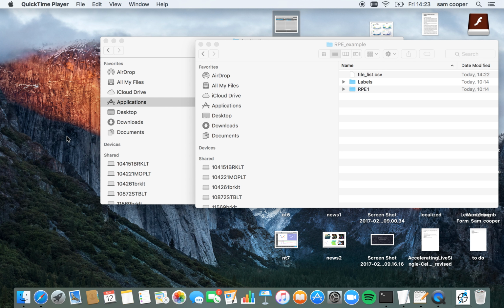Second online tutorial for NucliTrack. In this tutorial, I'm going to show you how to load data into NucliTrack using a text or CSV file, and I'm also going to show you how to export selected tracks with data that you're interested in.